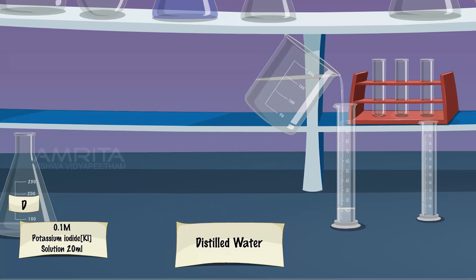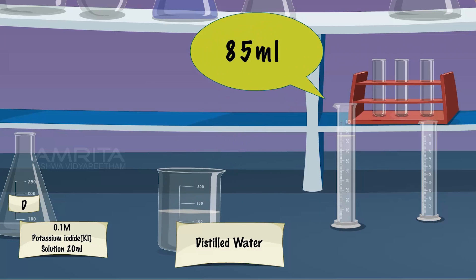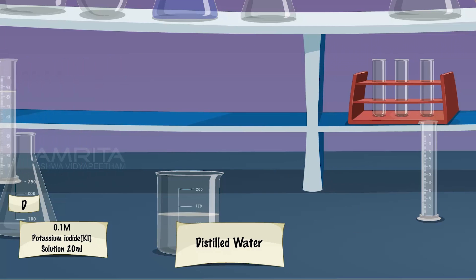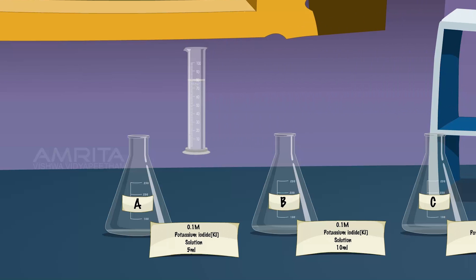Measure 85 ml of distilled water in a measuring jar. Pour it into flask A to make the total volume of the solution 100 ml.